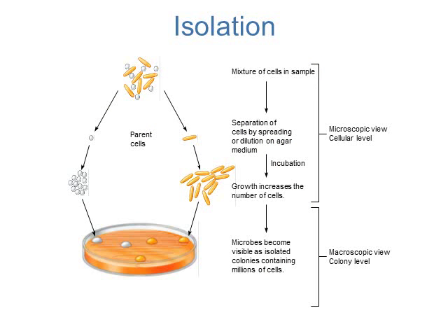So we'll start off with isolation techniques. A lot of times when you get a sample, you have lots of different bacteria species mixed into that sample. So you're going to take that sample, you're going to spread it out on a plate or put it in media, for example, and then put it on a plate. Each of these different bacteria species will get onto the plate and then they'll divide and grow. So they'll go through binary fission, and then you'll end up with something called a colony.